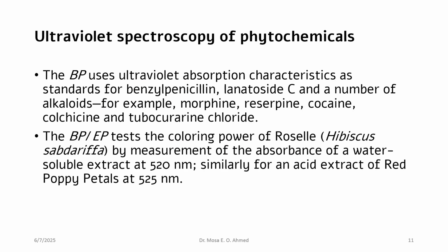Now, the application of ultraviolet spectroscopy for identification of phytochemicals, or natural products in general. The pharmacopoeias mention ultraviolet spectroscopy as an identification tool or quality control method for natural products.